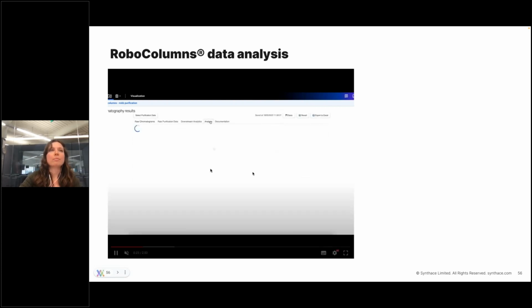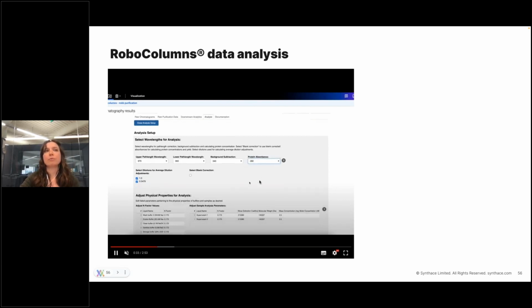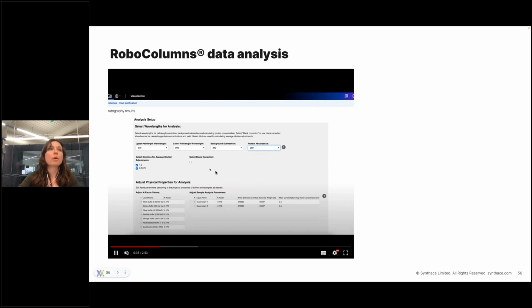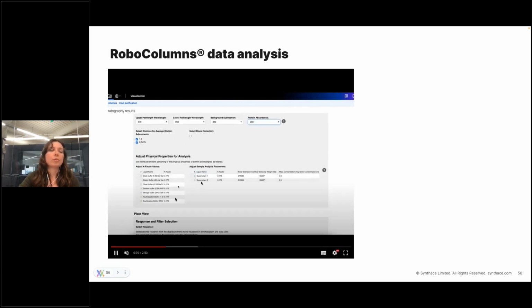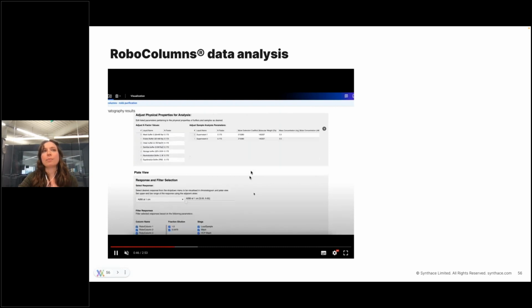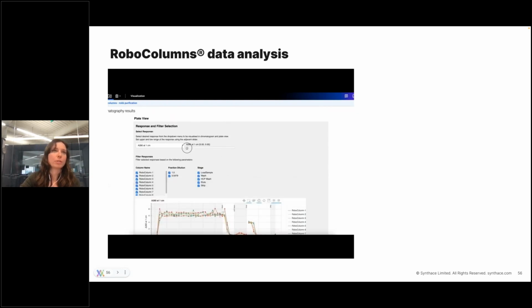whichever wavelengths you want. But where the fun really happens is in the Analyze tab, as here you select the wavelengths you want Synthace to use to calculate path length, what wavelength to use for background subtraction, and for protein absorbance. You can also optionally do blank correction, but you also then have the option to set up the K factors for the different buffers for your samples, and set up a molar extinction and molecular weight for calculating mass and molar concentrations.